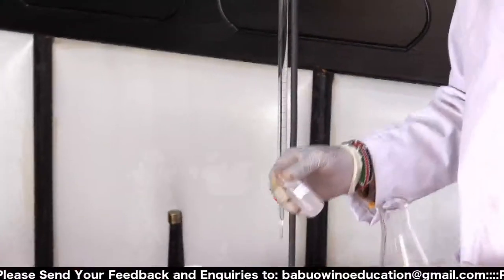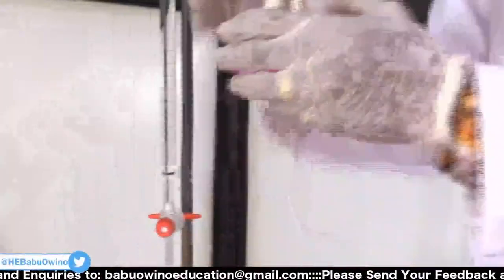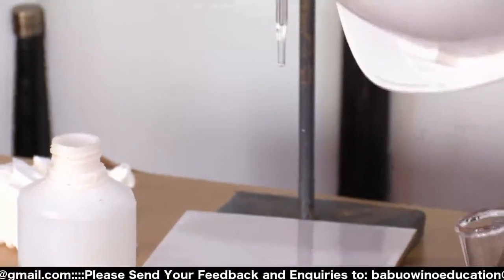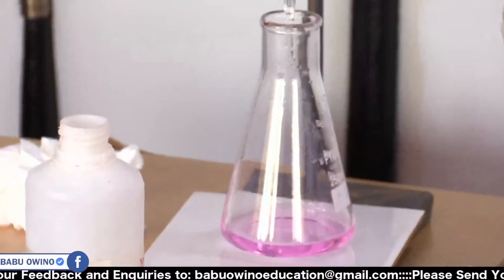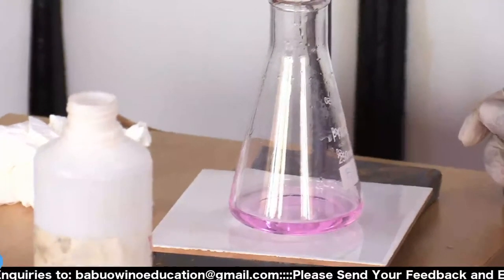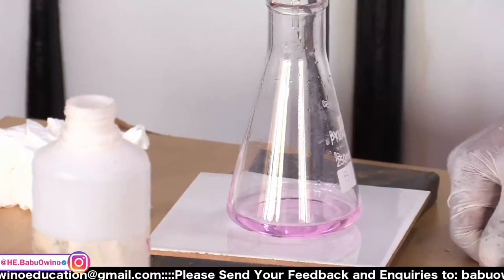Then 2 drops of phenolphthalein, or 3 drops, 1, 2, 3. So this time round, you can see we are starting from a pink color. This is the volume. That is the final reading. This is the initial reading. This is the volume used in centimeters cubed.